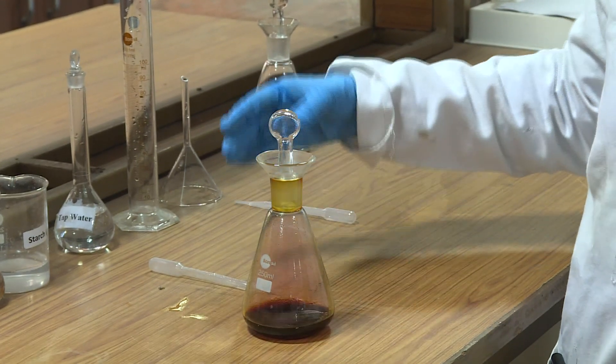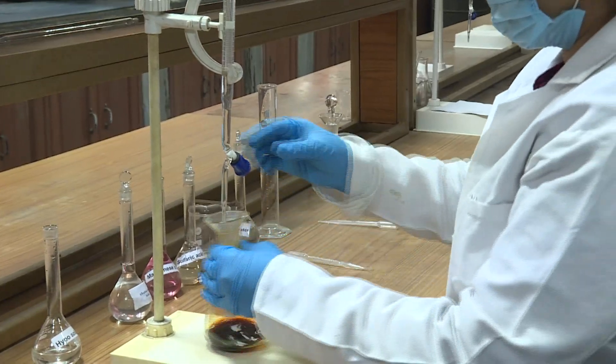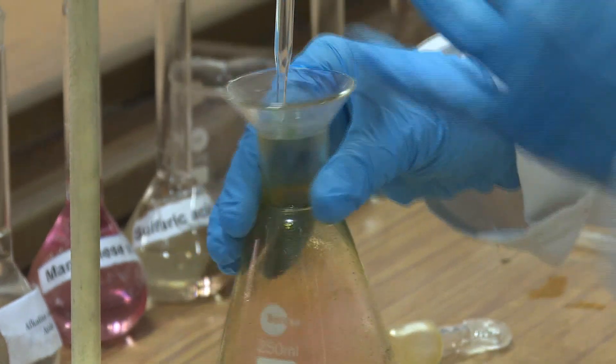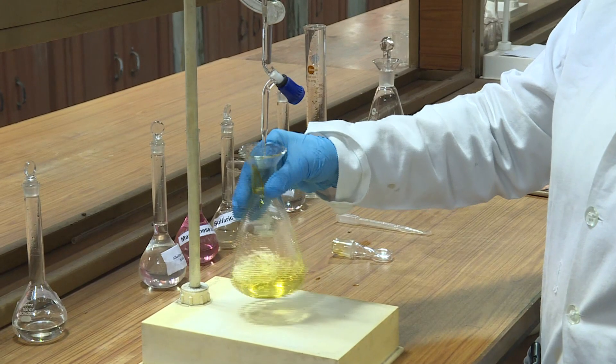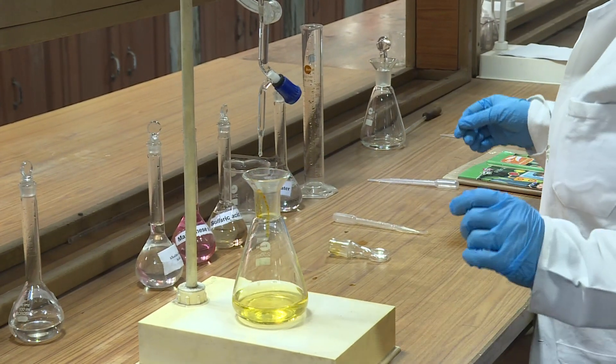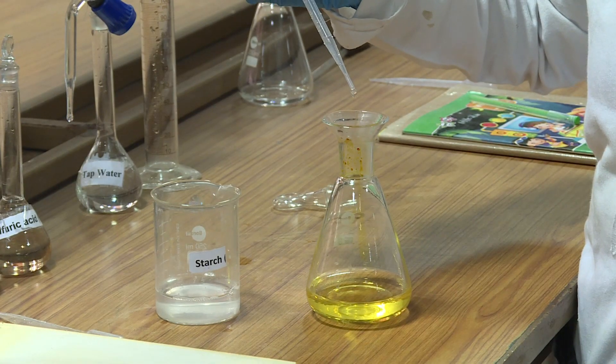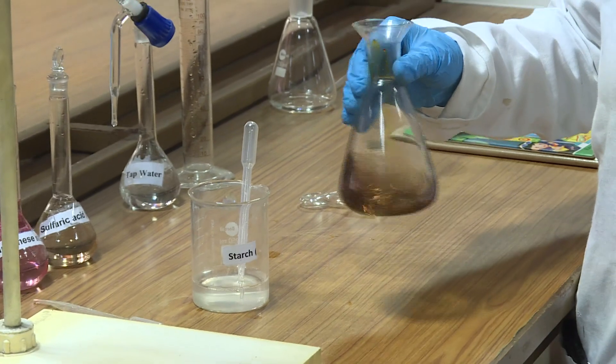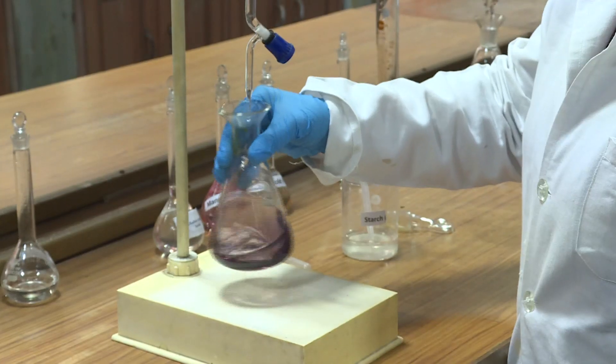Titrate against standard N/40 sodium thiosulphate solution until the color becomes faint yellow. At this stage, add a few drops of starch solution. The color changes to deep blue. Continue the titration until the solution becomes colorless.